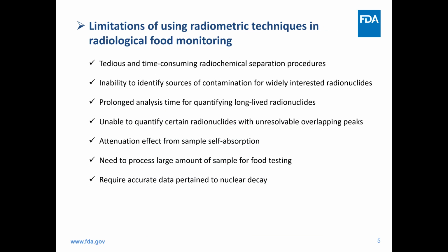The radiometric techniques are deeply entrenched in the detection and also the quantification of radionuclides. They also have well-known limitations and difficulties, which need to be addressed with alternatives. And here are just a few examples.